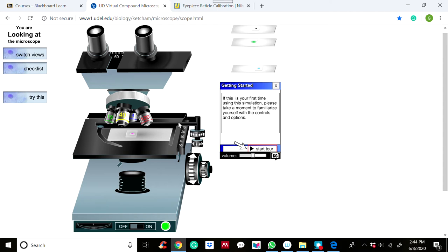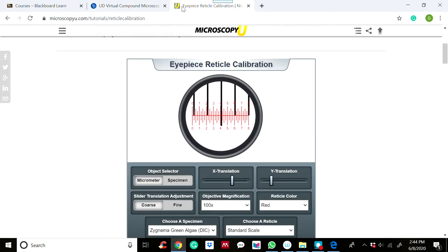Once you place the micrometer slide on the stage, you can use it to calibrate the eyepiece graticule divisions. When you place the micrometer slide on the stage instead of a specimen, the image of the micrometer will appear.